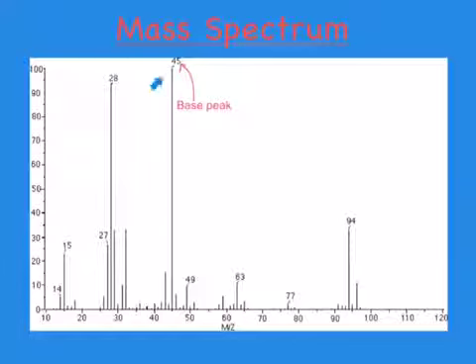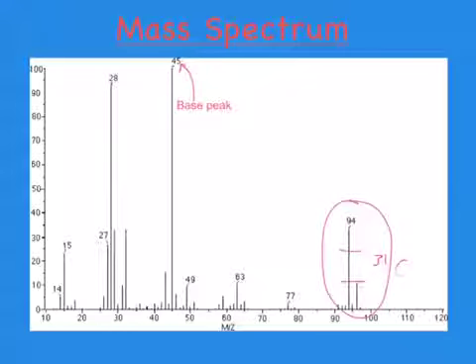Here is the base peak, and here is most likely the molecular weight, since it appears to have a 3:1 intensity ratio, verifying that this molecule does have a chlorine atom. To find the molecular formula, subtract the atomic masses of electronegative atoms like chlorine and oxygen from the molecular weight first. Recall that the chlorine and oxygen were determined from the IR spectrum.